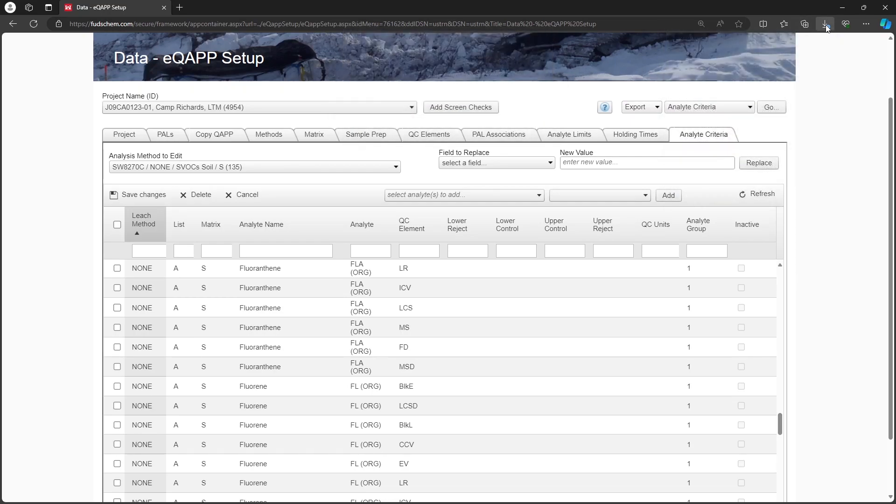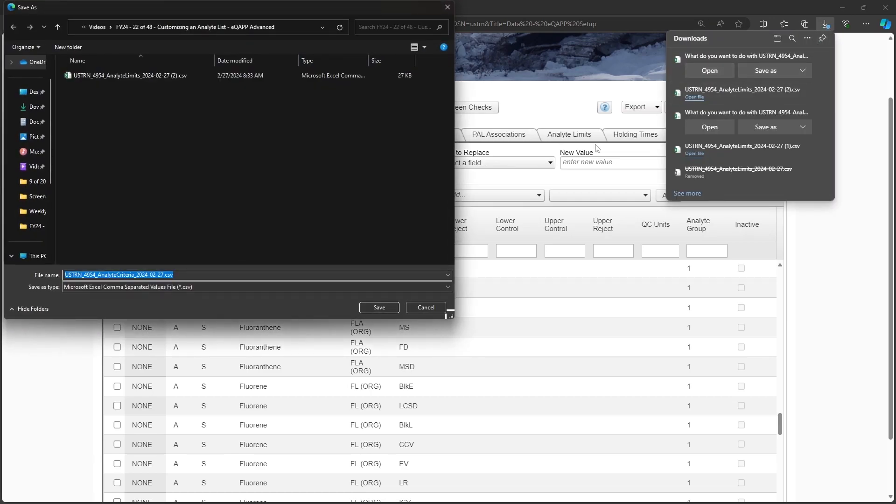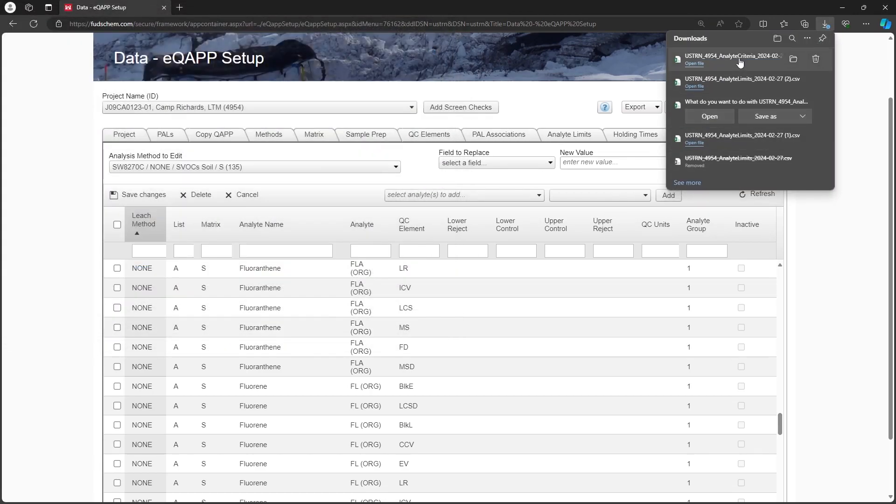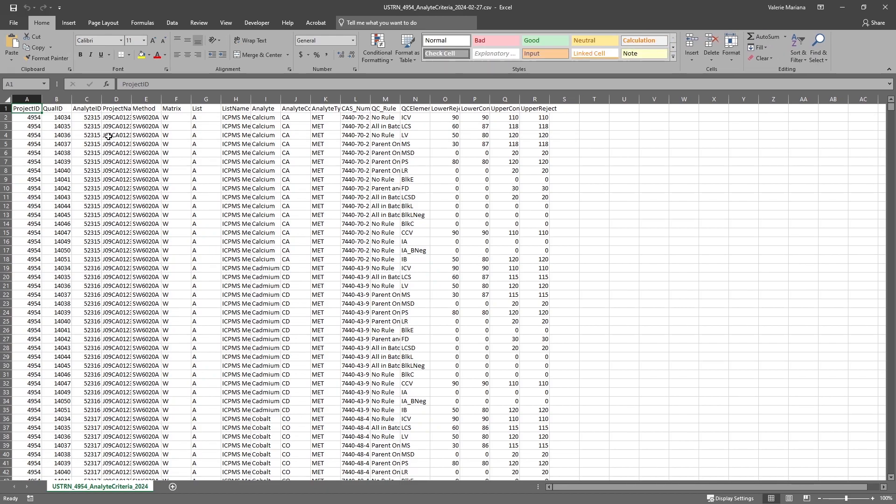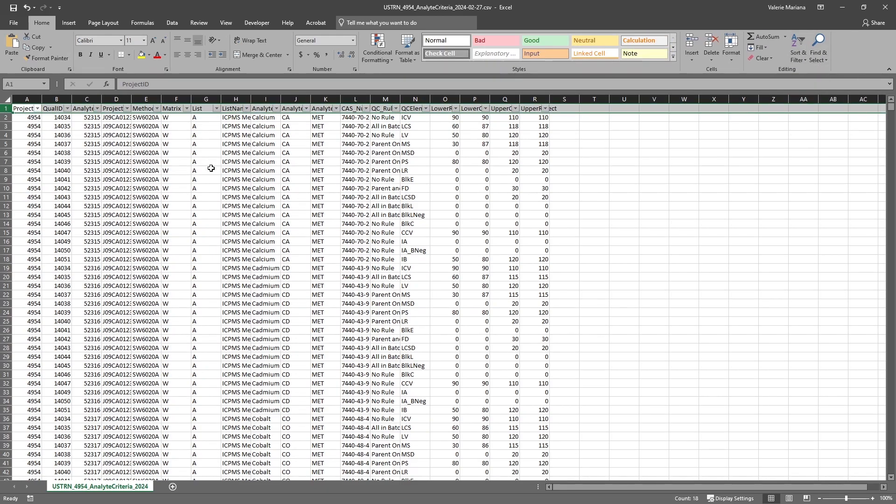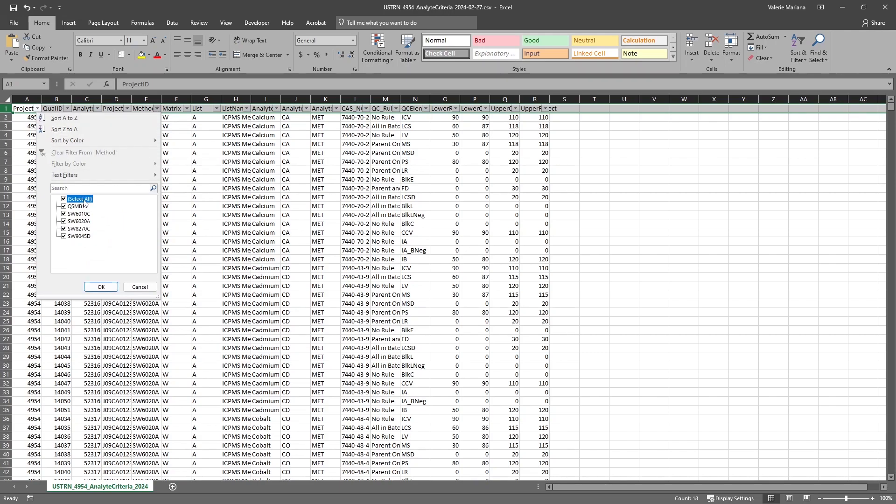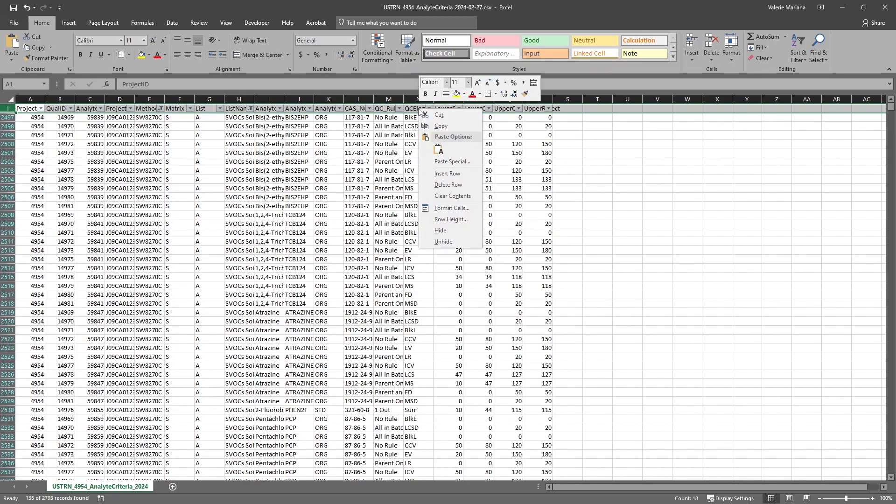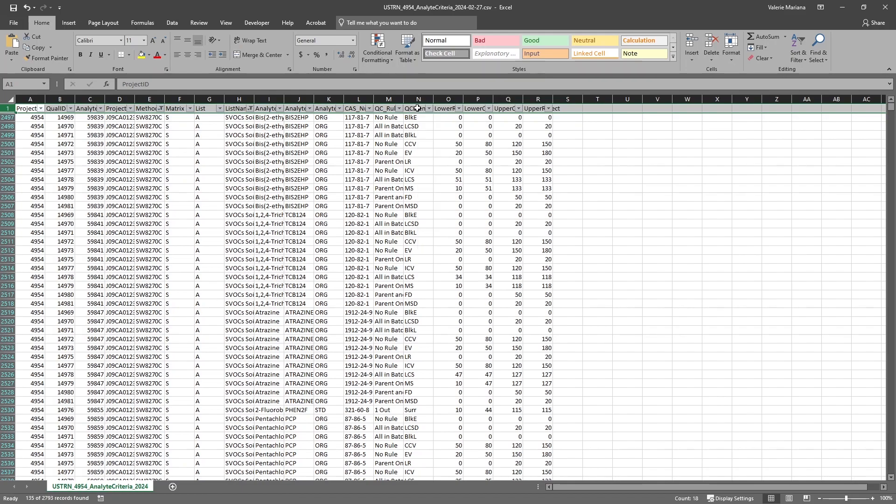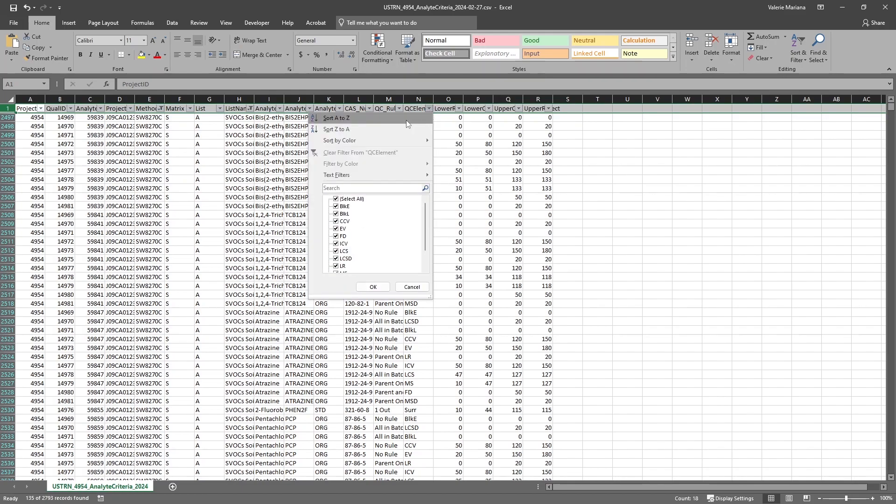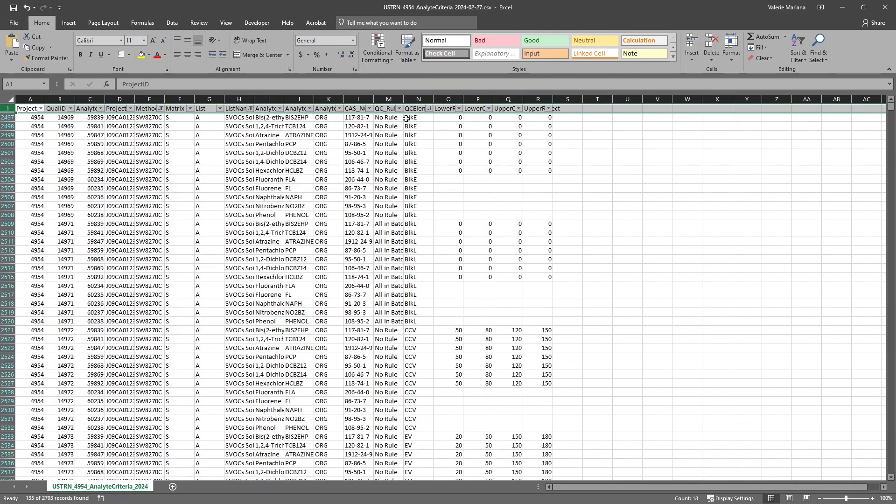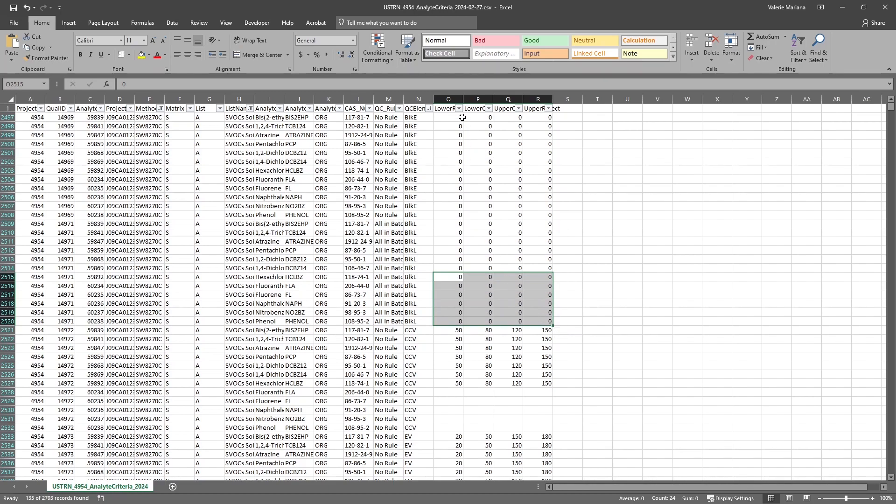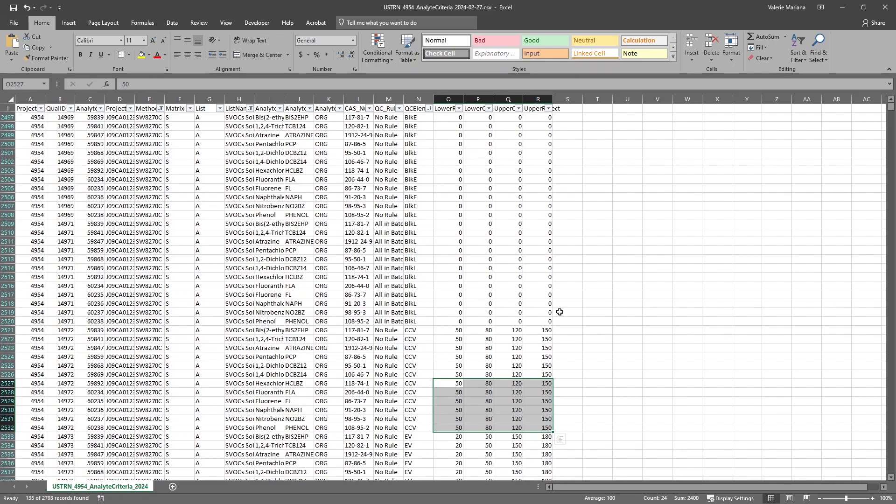Open the CSV file. Let's filter to find our method and matrix. We can sort the QC elements tab from A to Z to get all of the like elements together. This helps us see which values are typically used for an element and copy them down to any blank rows. For example, we can see the BLKE element is filled with zeros for several Analytes.